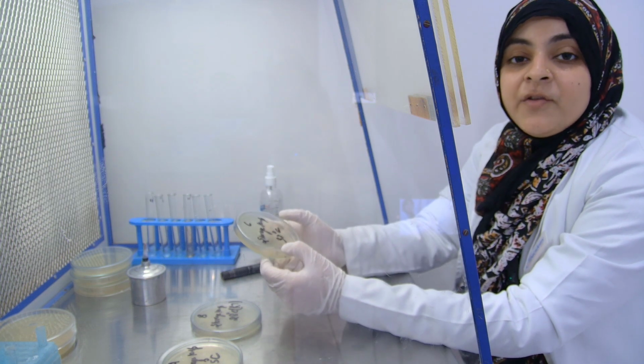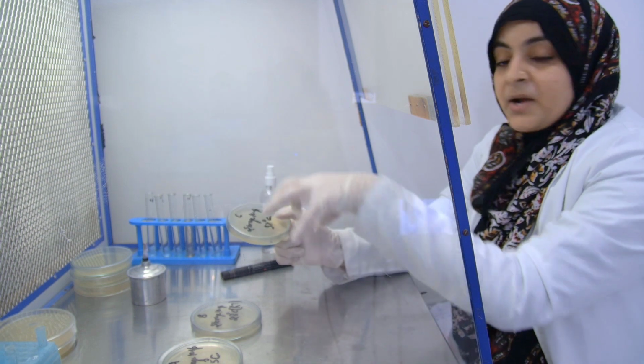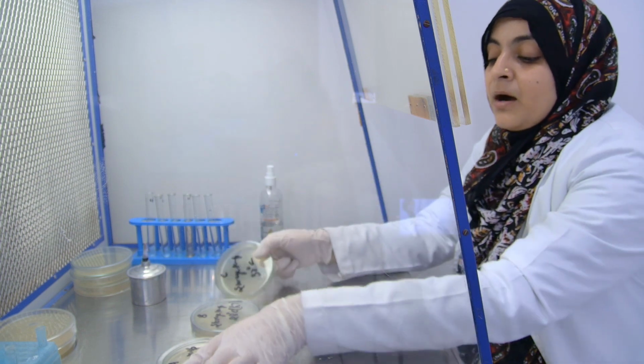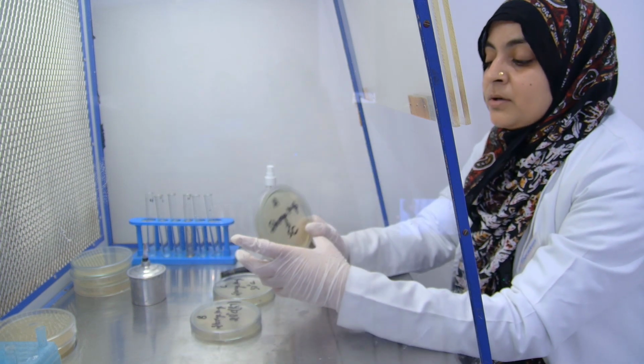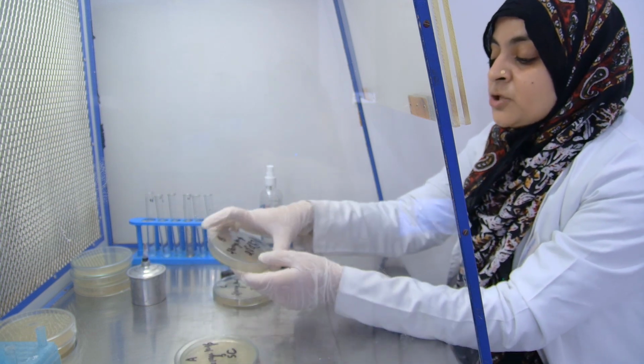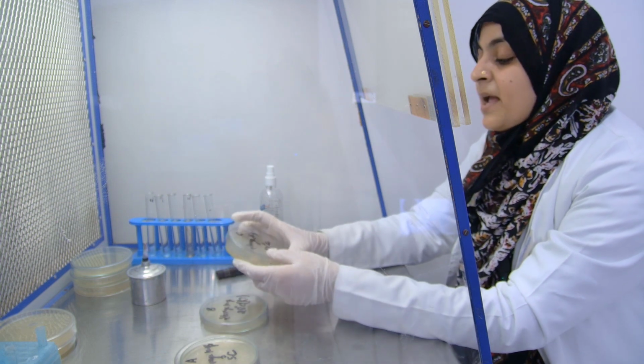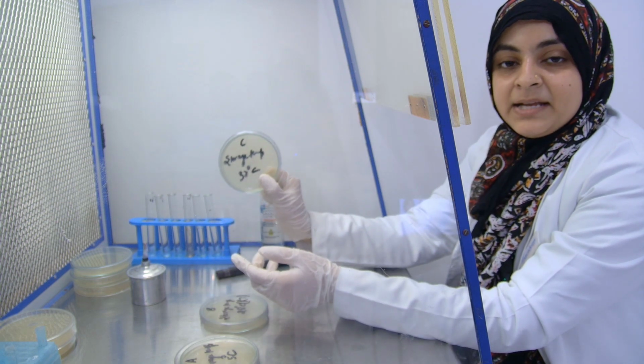So at the end of the video, I will attach the photos related to this experiment, like the image related to storage at 5 degrees Celsius, then the image related to 28 degrees Celsius or room temperature, and storage at 37 degrees Celsius.